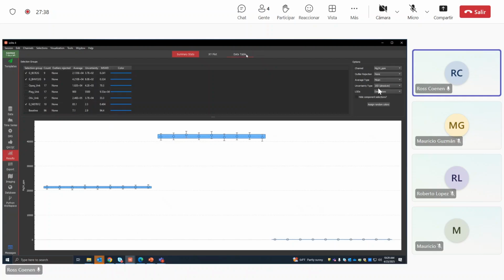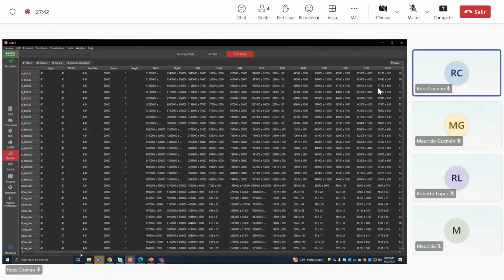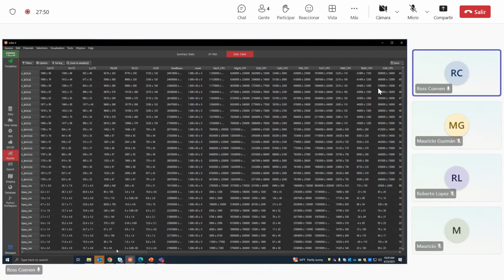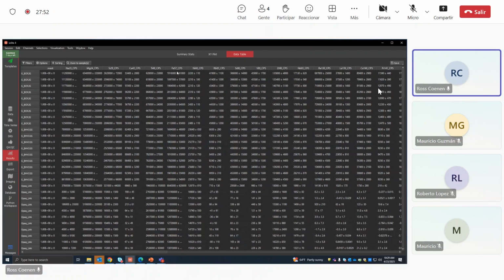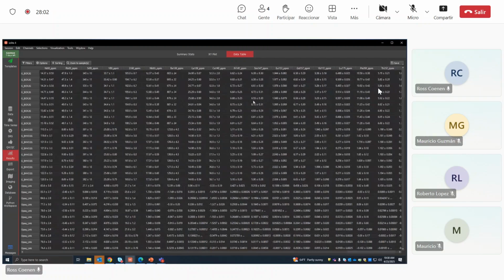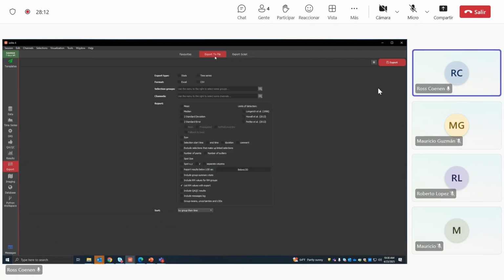We can now do a data table, which shows everything in a spreadsheet view. First, where it just says the element is the input. If we scroll over, we see counts per second, which is baseline subtracted signal intensity. And then scroll all the way over, ppm. And then from that, you can export to file.